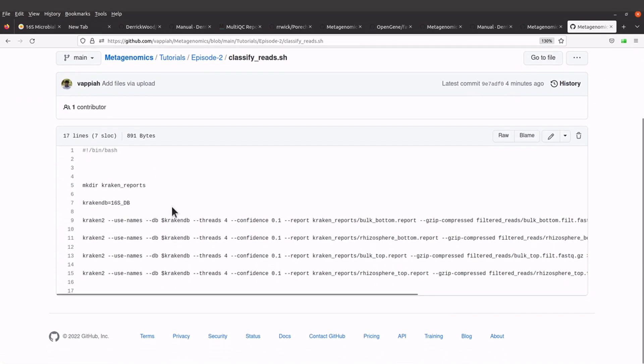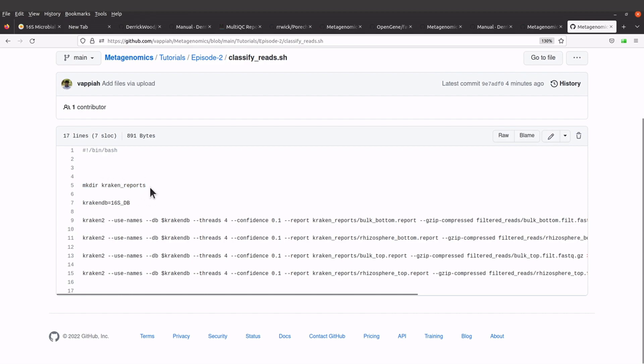When you click it, the command will be displayed for you. I'll explain a couple of things here. This command will create a directory called kraken_reports, so this directory is where the reports will be stored or saved.